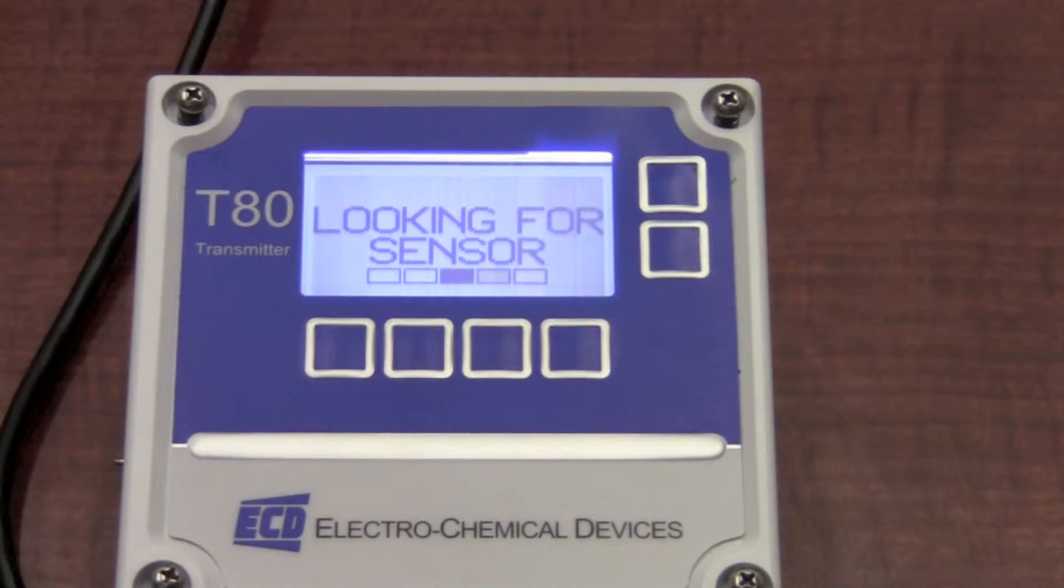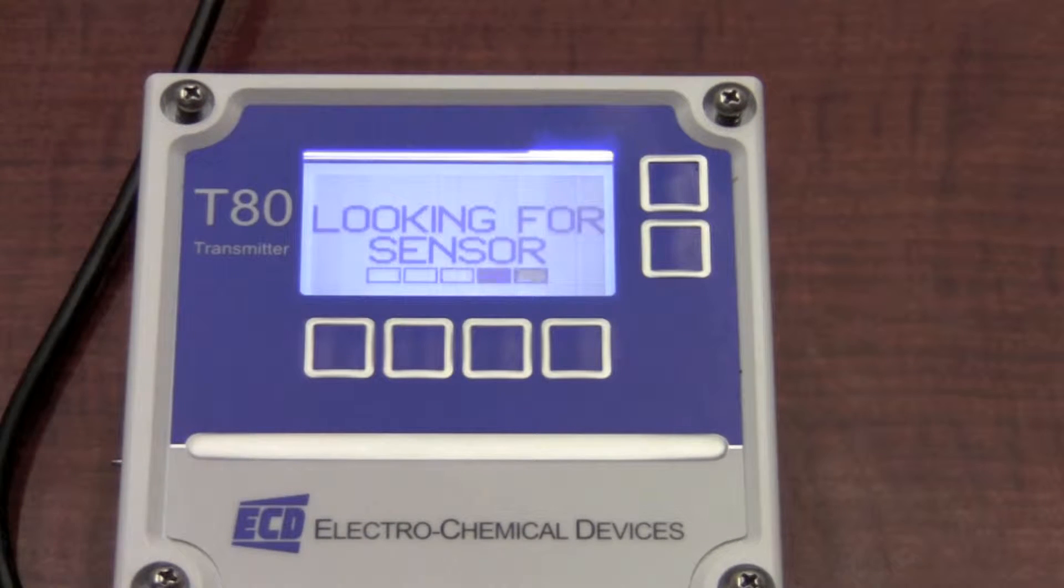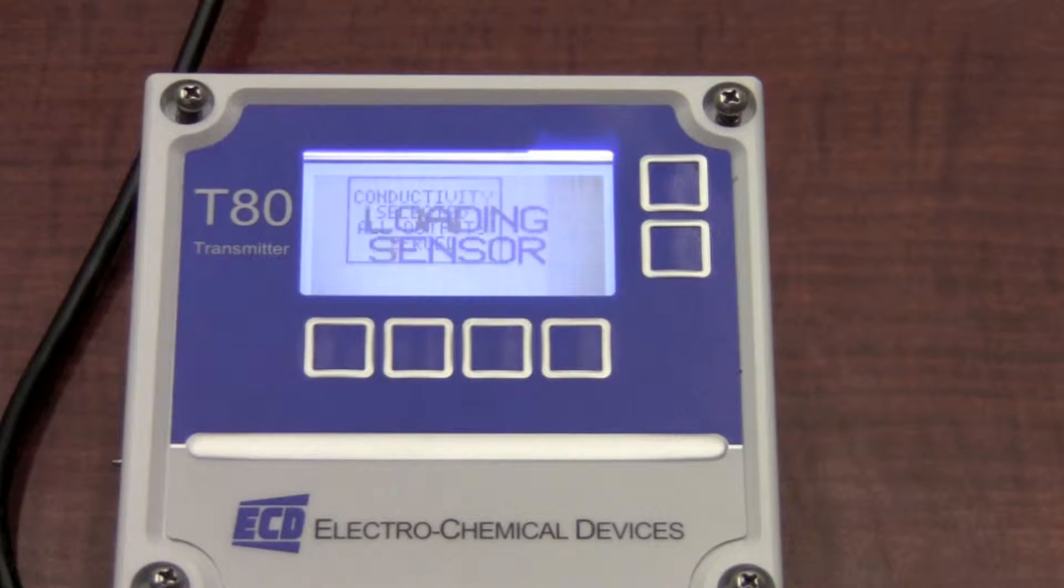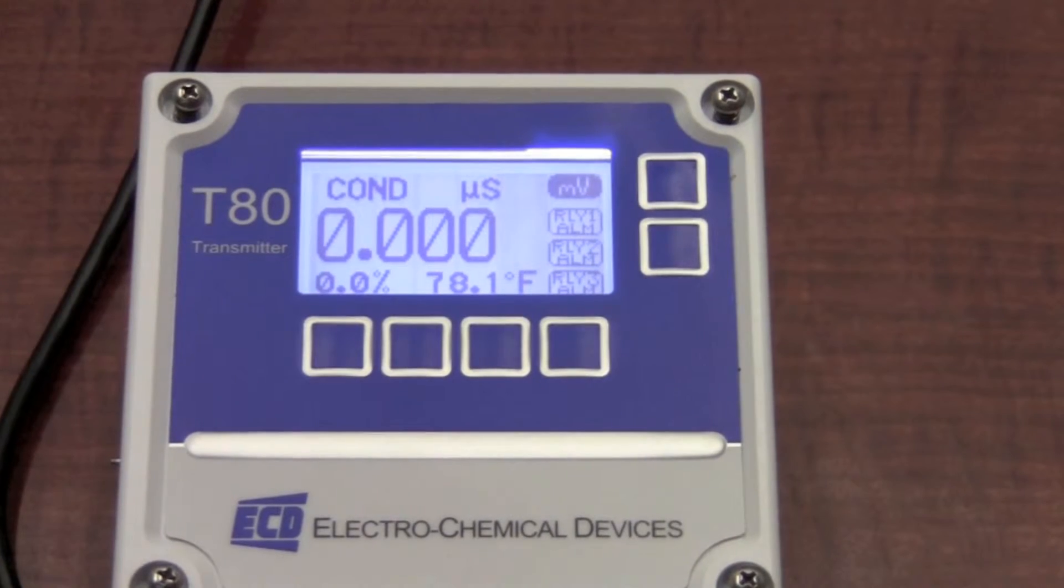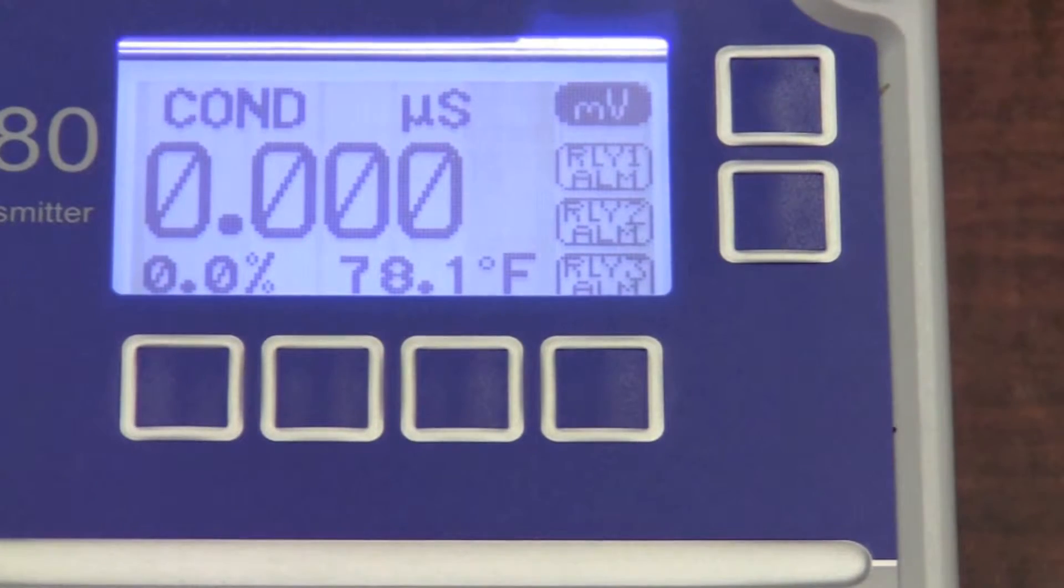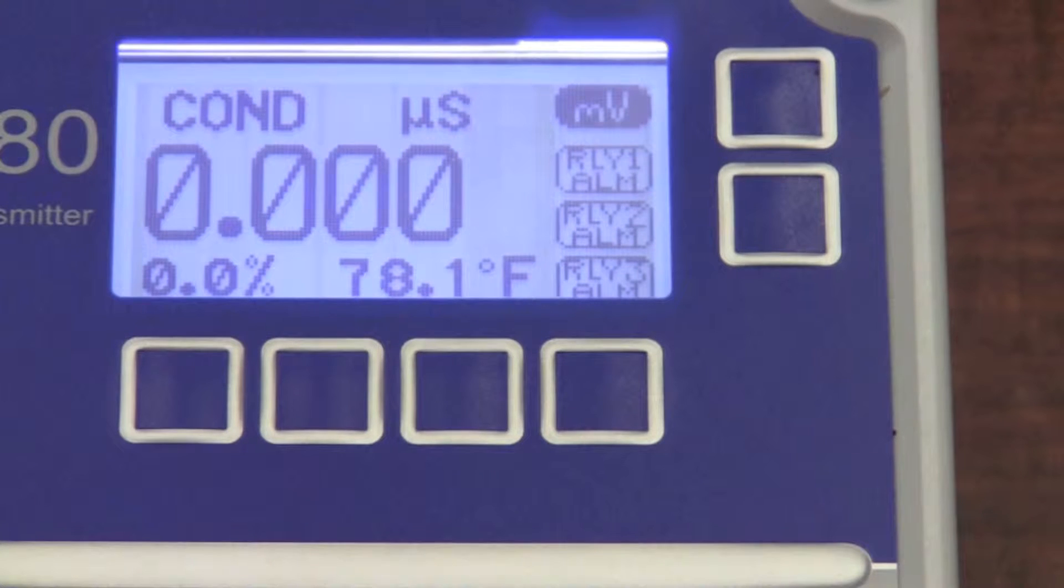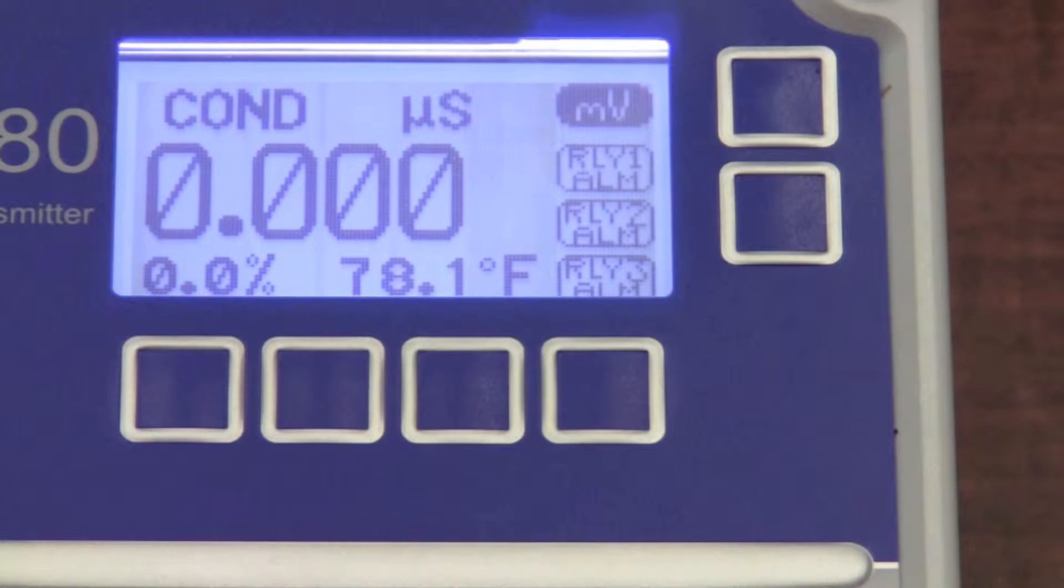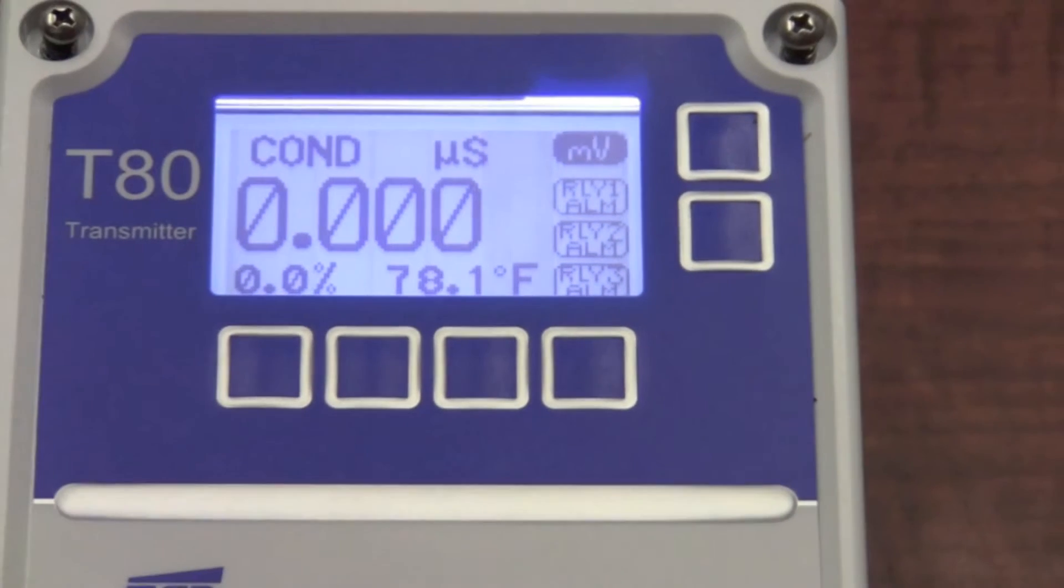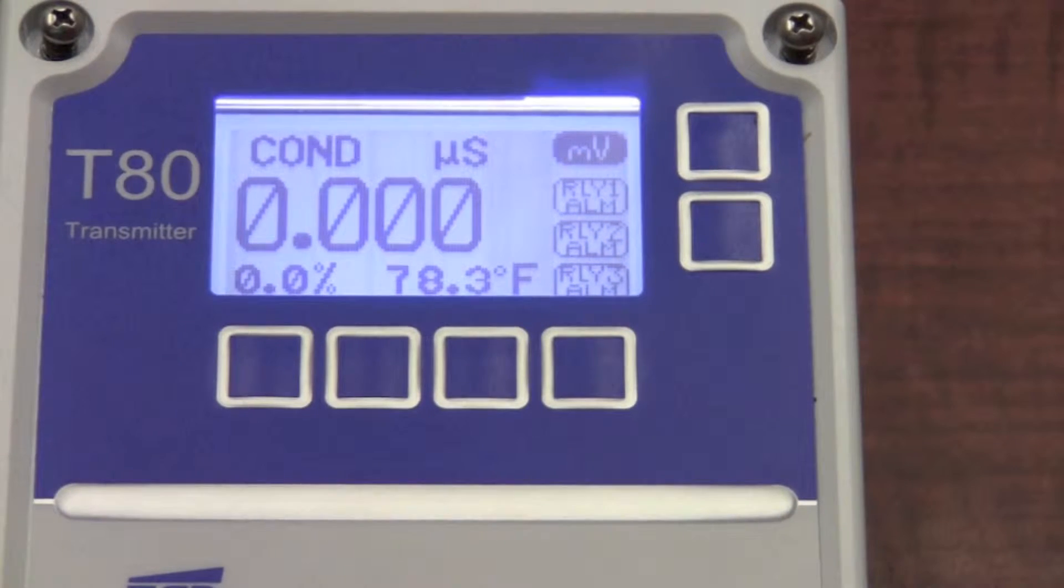Upon power up of the T80 intelligent transmitter, it's looking for a sensor. Once a sensor is connected, it interrogates the sensor for the type and span of measurement. I've just connected a conductivity sensor, and you see on the display, I show the type of measurement conductivity. I show it in microsiemens. I show the percentage of output and the temperature. On the right hand side, I show status of the internal relays.